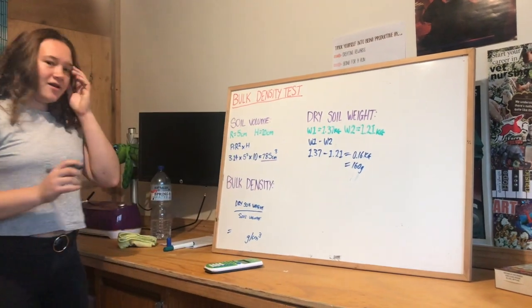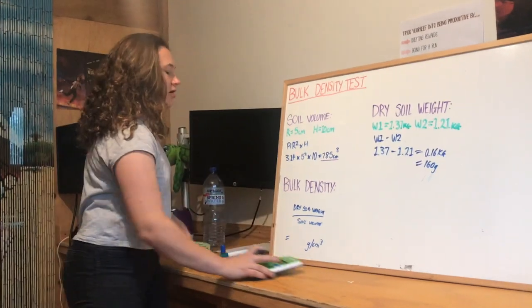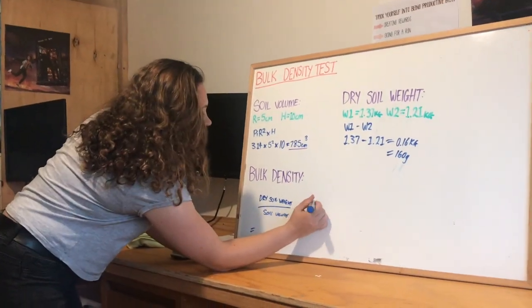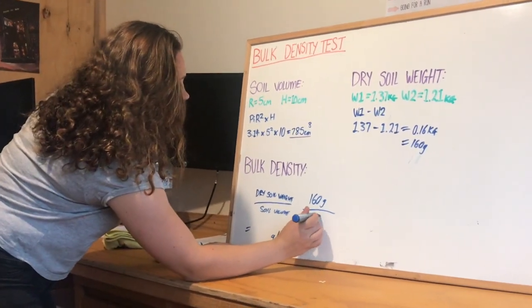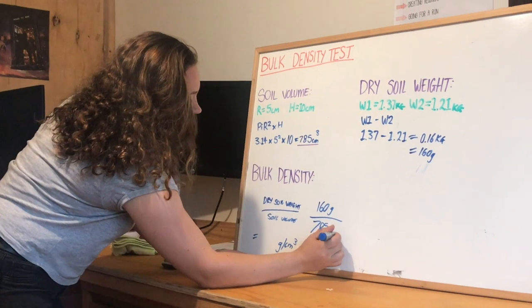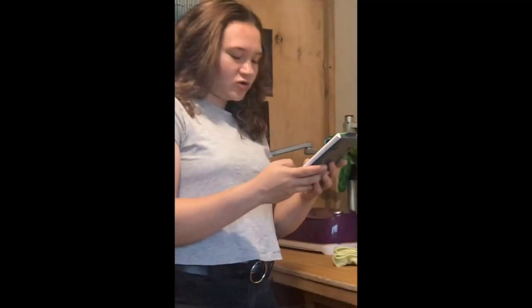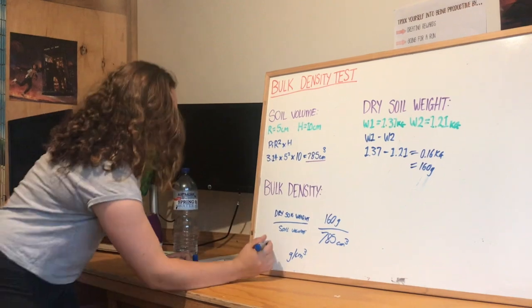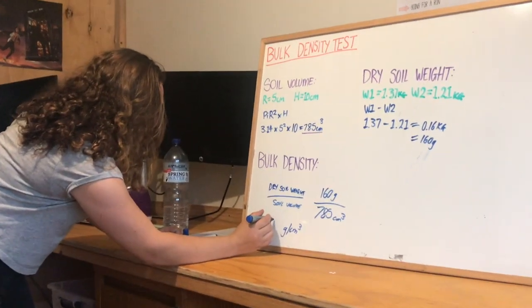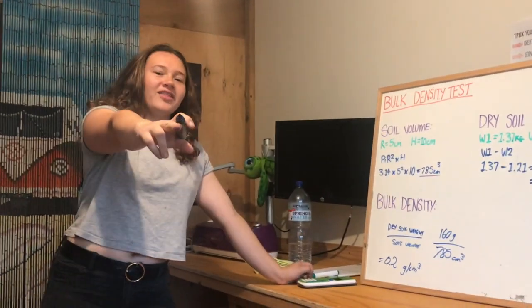There we go. Finally, for our bulk density, all we're going to do is dry soil weight over soil volume. So that will be 160 grams over 785, and that's obviously centimetres cubed. So our total will be, let's calculate, and our total is 0.2 grams per centimetre cubed. And that is how you calculate bulk density, boys and girls.